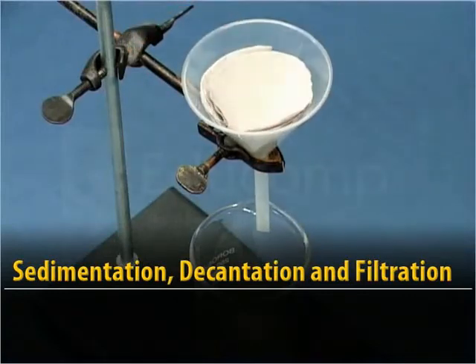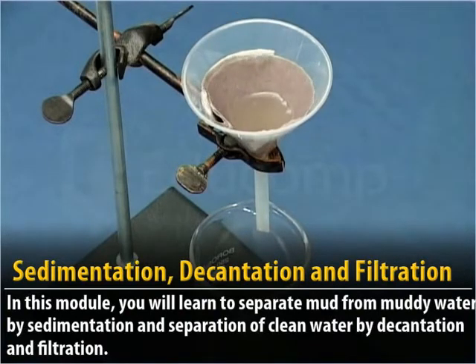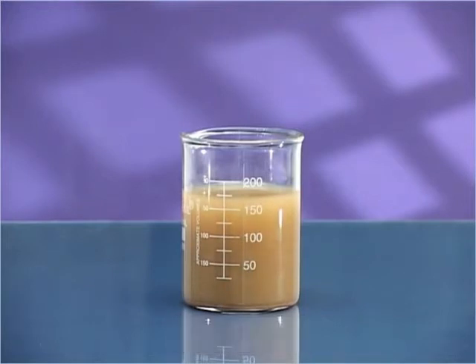Sedimentation, Decantation and Filtration. In this module, you will learn to separate mud from muddy water by sedimentation and separation of clean water by decantation and filtration. How to get clean drinking water from this muddy water? Well, we shall use few methods to separate the mud from this water-mud mixture.